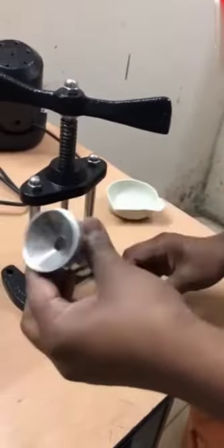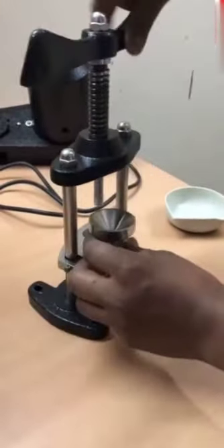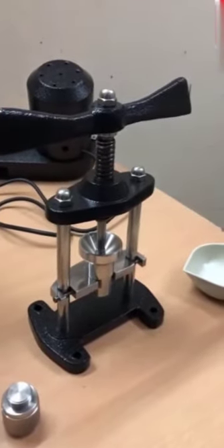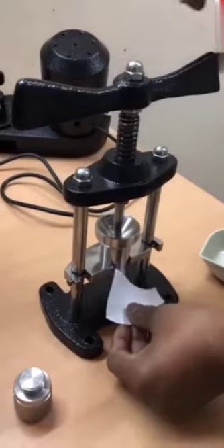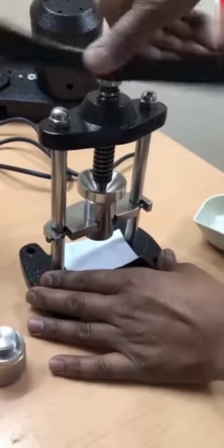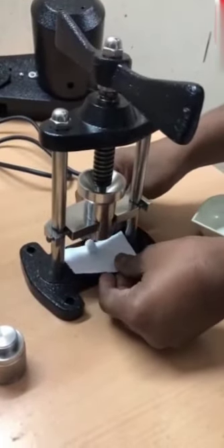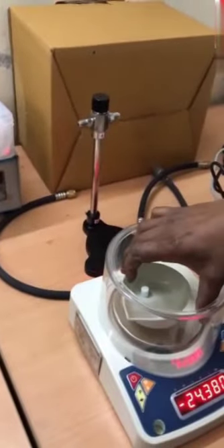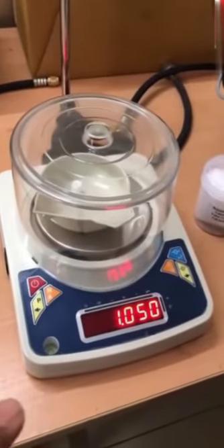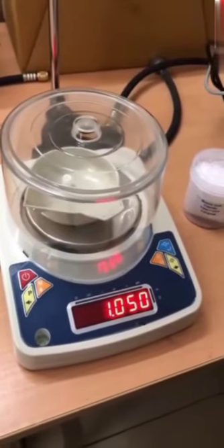To take out the pellet from the pellet press cup, slowly rotate the handle and take out the pellet. Put it on the small paper. This is the pellet. Now we again weigh this pellet — we will put it inside the weight box. This is the final value. You see we had taken 1.060, and now it is 1.050.